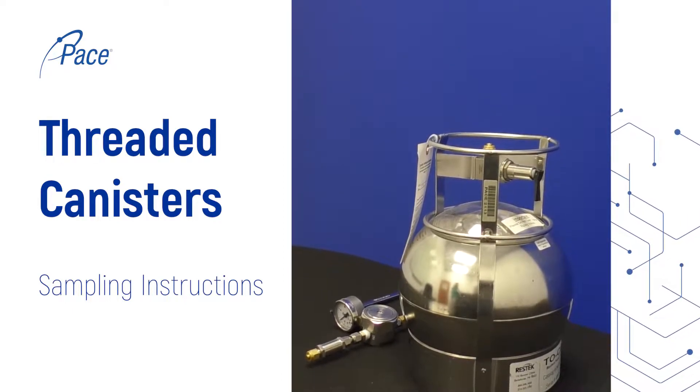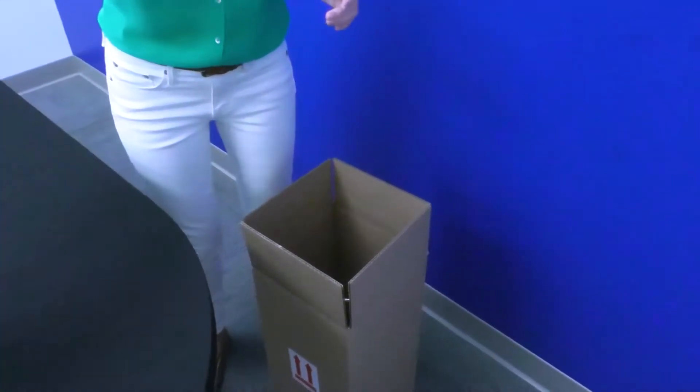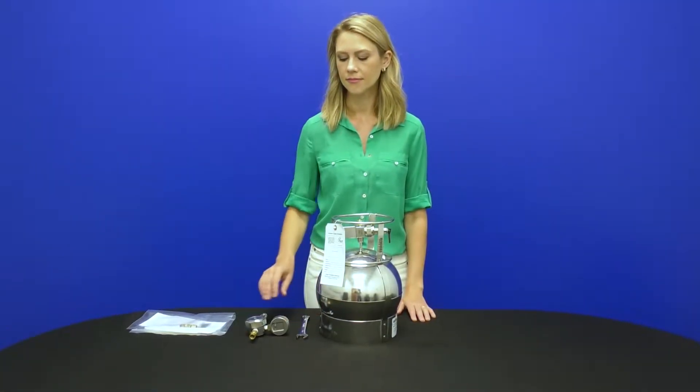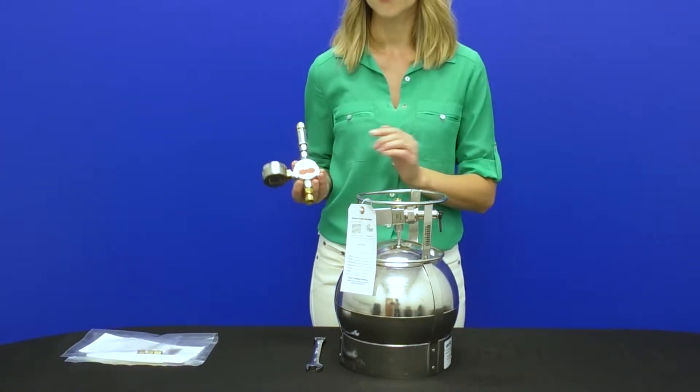First, review the contents of the box to ensure you have everything you need. Unpack canisters by lifting from the metal frame on top and not the valve. If collecting samples with different flow controller settings or durations, confirm they are correct and you can clearly identify which is which.